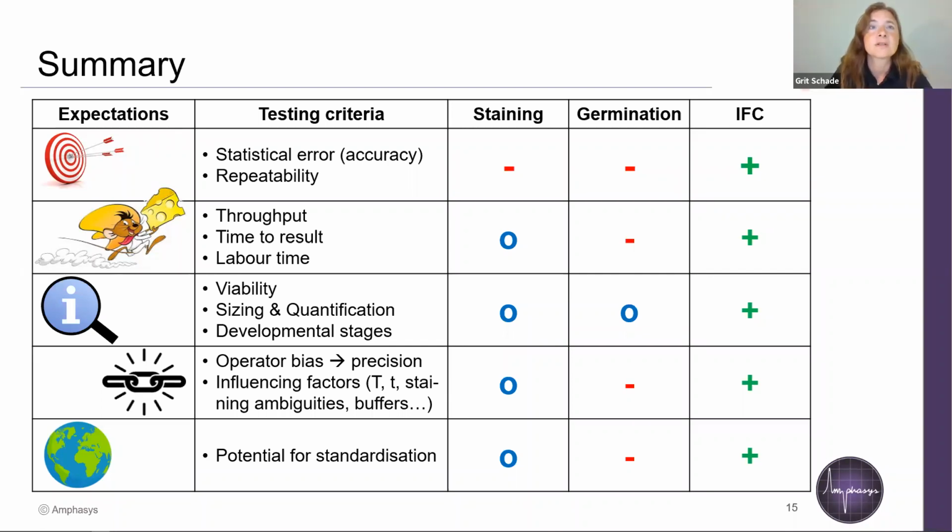There came up some other questions about germination. Did we test germination in separate batches, or did we recover the sample from the impedance measurement and then put it on the media?